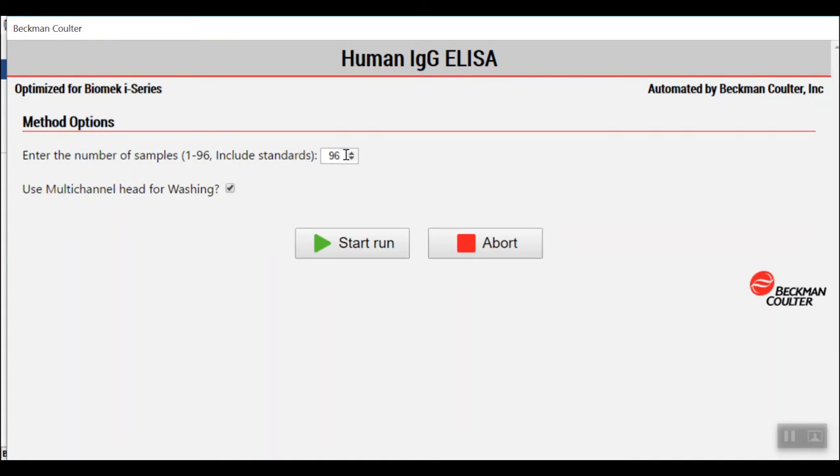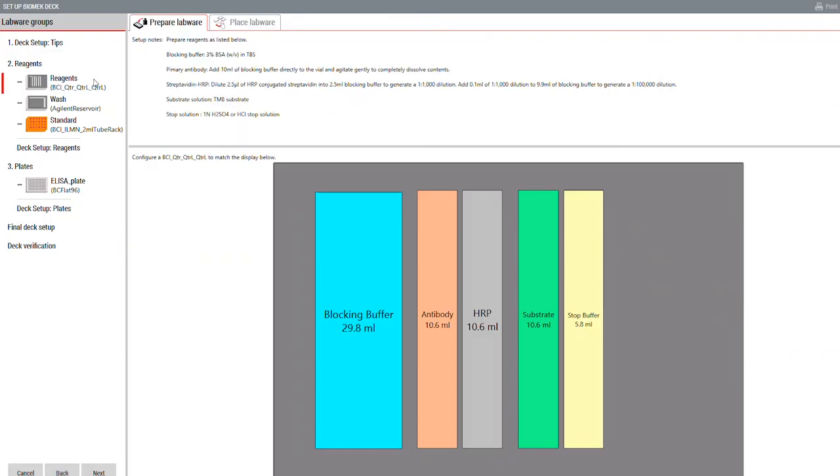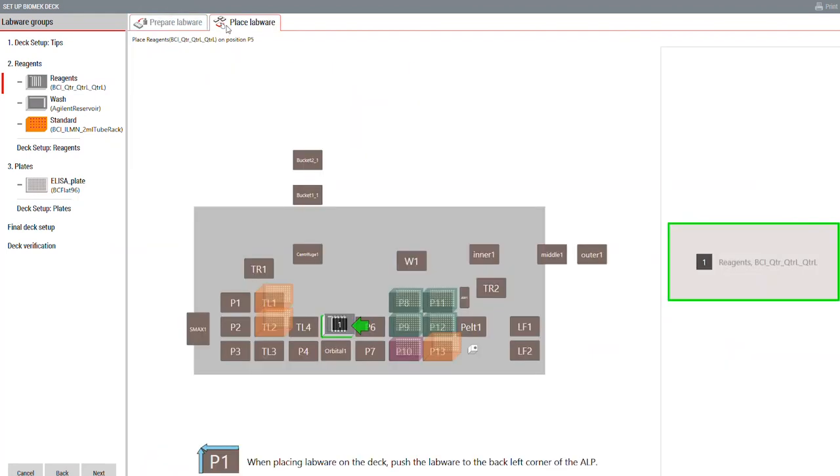Suppose you're running extra samples today. Guided labware setup adjusts labware quantity in deck layout as sample quantity changes. It provides specific step-by-step text and graphical setup instructions to prepare reagents.